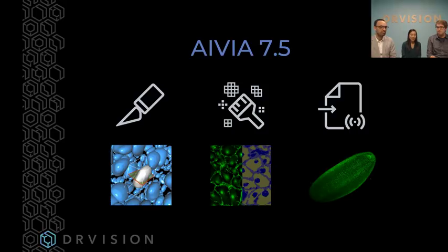All right, so we do have some questions for the live import. Luciano, you showed specifically a data set that was acquired on the light sheet microscope. Can this work for confocal microscopes? Yeah. In fact, it works for any microscope that creates 3D images. The criteria or the limitation is how the images are being generated. As long as the microscope creates files that fit into the supported formats that we mentioned, and we're of course going to expand the list that is supported, it's fine.